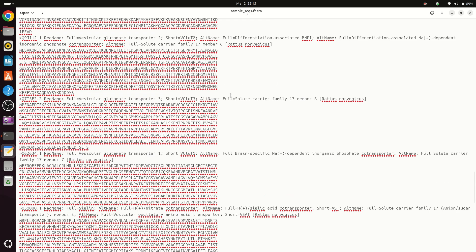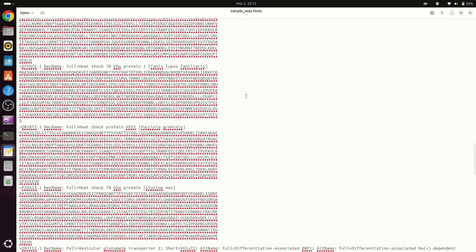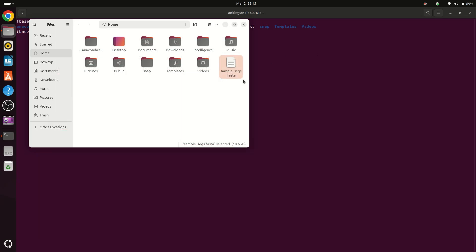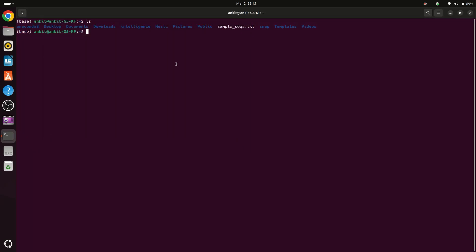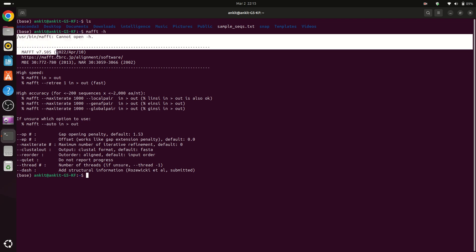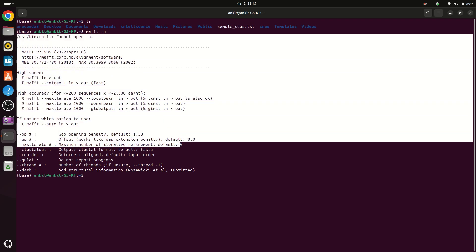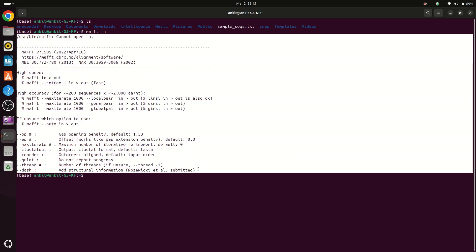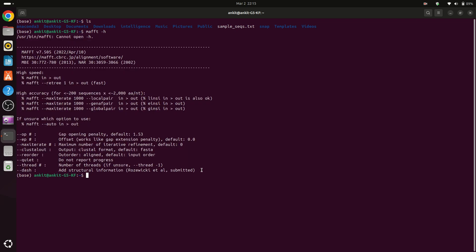Now to run MAFFT we have installed MAFFT. For checking MAFFT you can type mafft -h. Now we can see that MAFFT is successfully installed in our system.